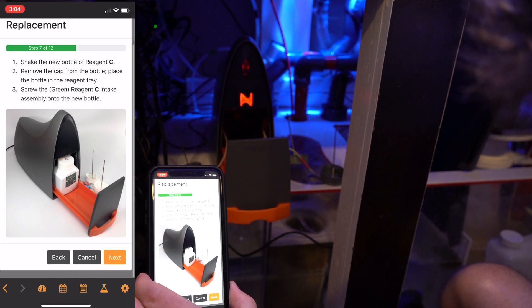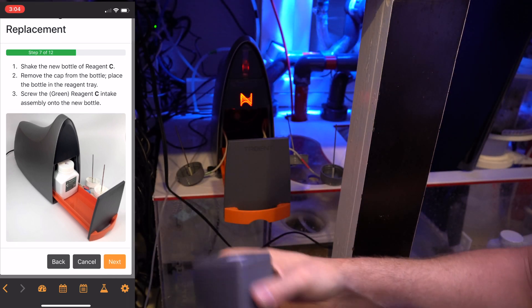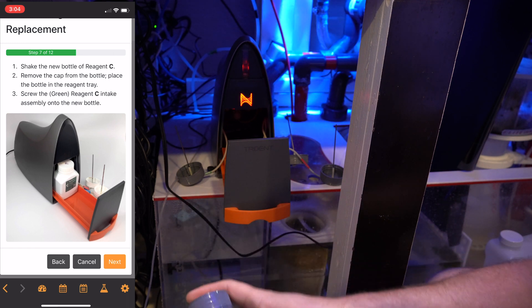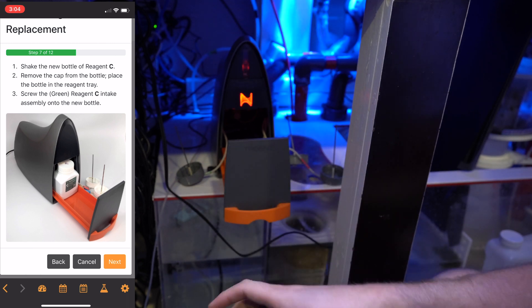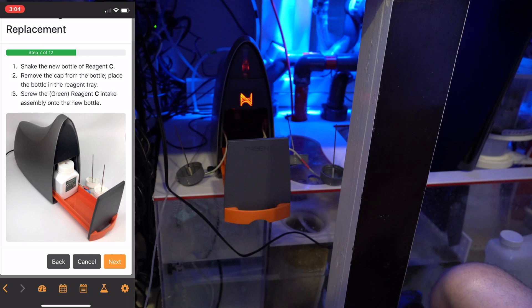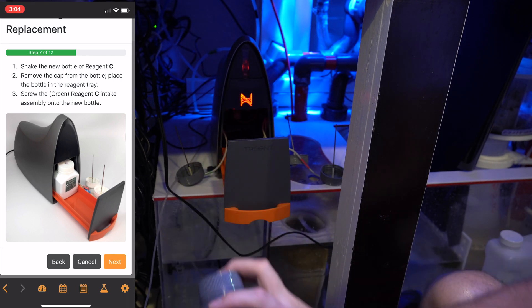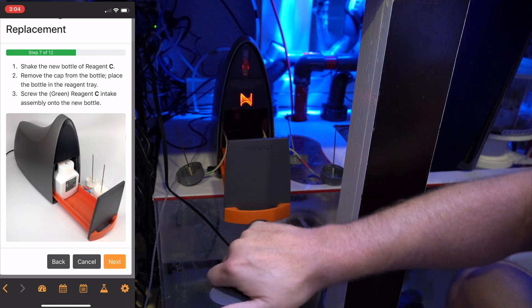A big thing is you want to make sure you shake it, because you want that reagent to get mixed up — it's probably been sitting for quite a while and the solution is going to settle. You want to make sure you mix it back up. I'm going to go ahead and shake all three to give it some time to settle out after shaking. The reagent C that's empty — I'm going to take the cap off that one and put it on the next one for disposal.